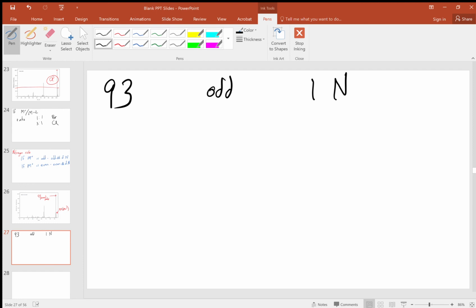We know it can't be more than that because if we had 7 nitrogens, that would total to 98. But we know it has 1, 3, or 5 nitrogens. I'm going to pick 1 nitrogen because on a molecule this small, that's the most likely candidate. But who knows? So as I said, we're taking a guess.